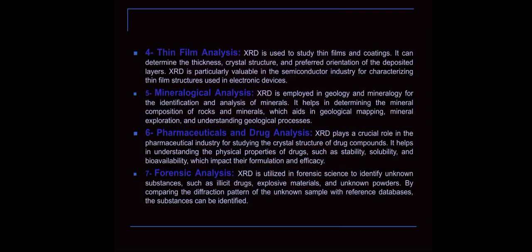XRD is used to study thin films and coatings. It can determine the thickness, crystal structure, and preferred orientation of the deposited layers. XRD is particularly valuable in the semiconductor industry for characterizing the thin film structures used in electronic devices. Fifth one is mineralogical analysis. XRD is employed in geology and mineralogy for the identification and analysis of minerals. It helps to determine the mineral composition of rocks and minerals.